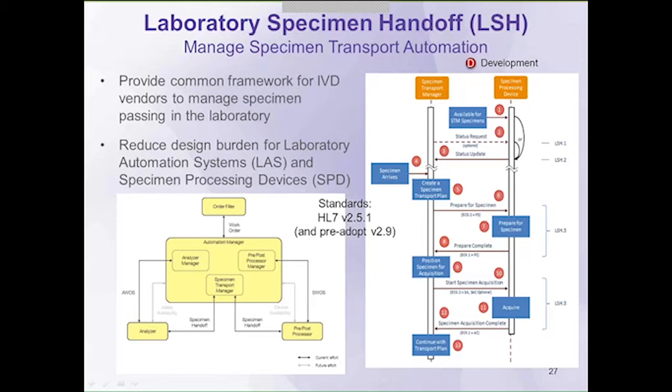It's important to note that the profiles that speak to automation don't necessarily speak to the handoff of specimens once it leaves that device. So this is specifically focusing on the transactions between devices, where it's moving perhaps from one analyzer to another analyzer, and that handoff needs to be managed smoothly and electronically without human intervention if possible. Next slide.